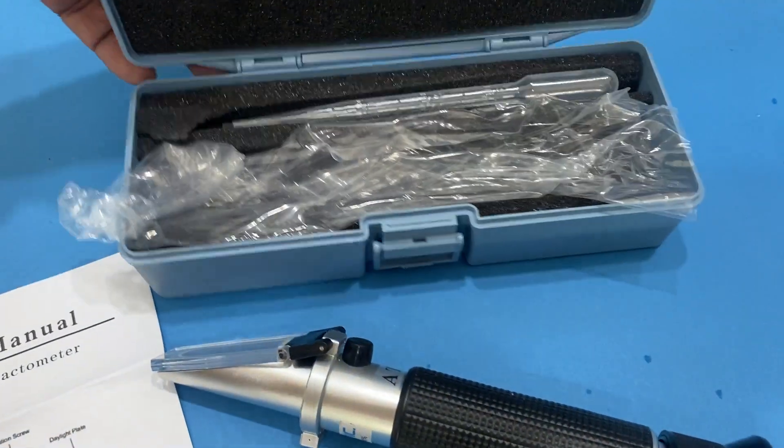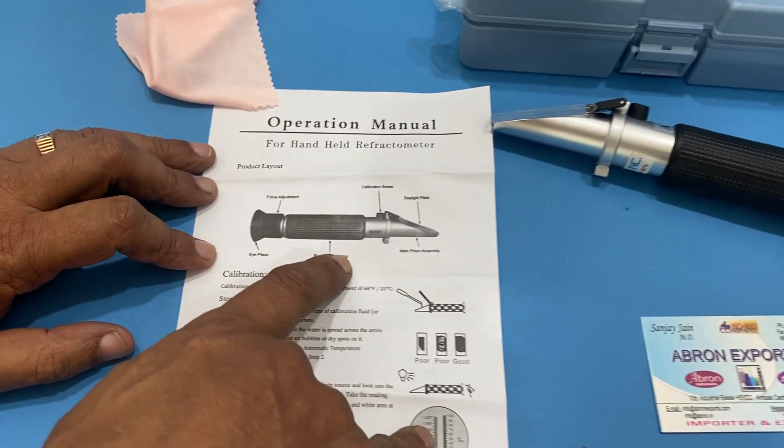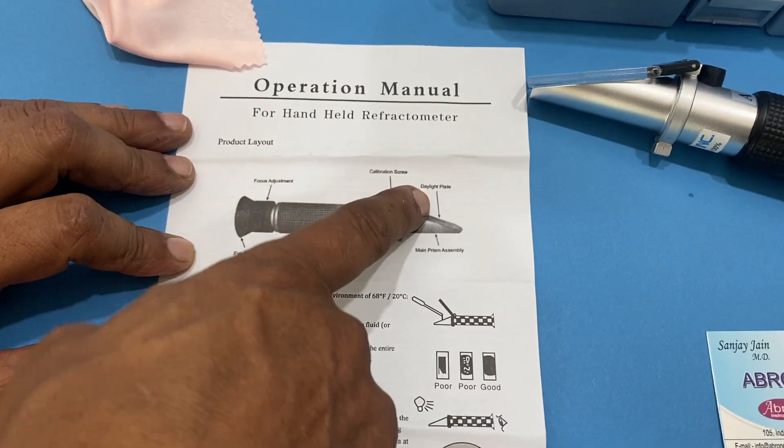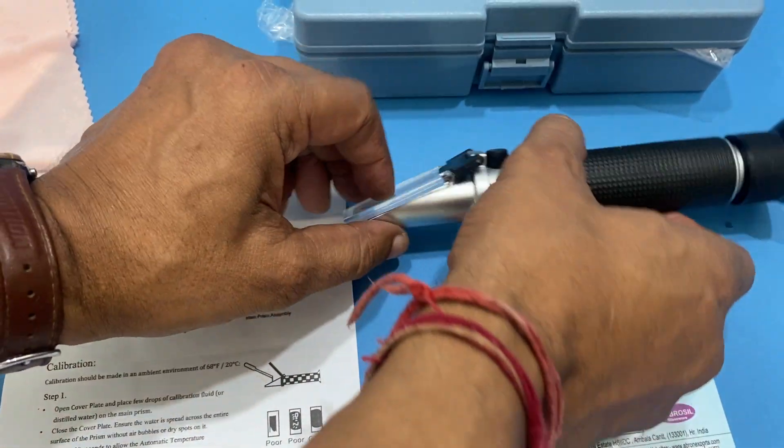The instrument comes with packing, a dropper, and all necessary parts. There is a rubber hand-holding grip and a calibration screw. To use it, put a drop on the prism plate and then close the cover window.